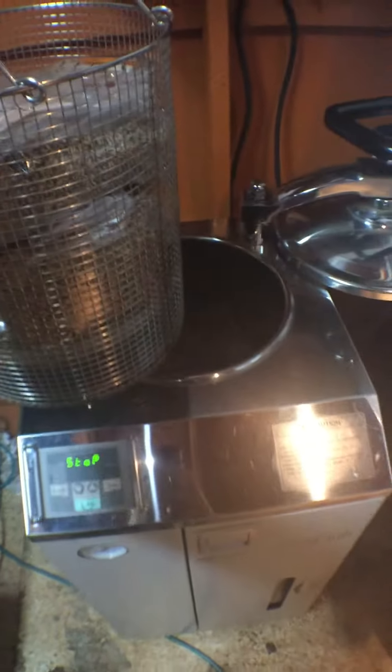This is our Yamato SE510 autoclave. So we're going to put the other basket in — we have one down there so far. And we basically just kind of get her all tight. Here we go.